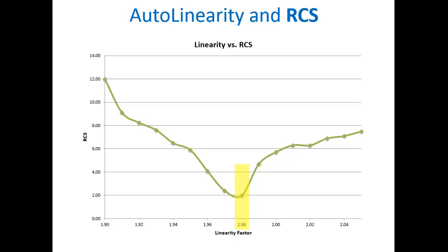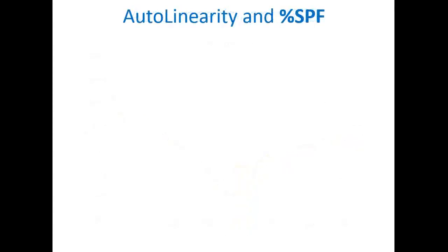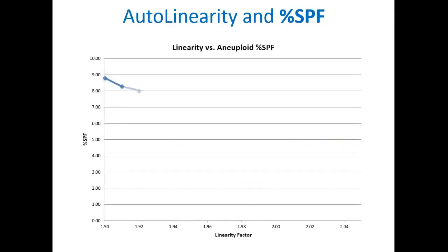How important is the linearity setting in estimating S-phase fraction? It can change the S-phase estimate significantly, as shown in this example graphic. A non-optimal linearity setting results in inaccurate aneuploid S-phase estimates, the appropriate value having been determined to be 1.98.